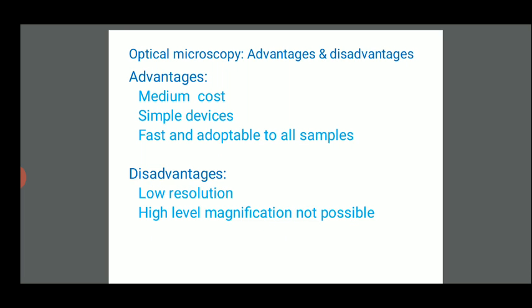And the advantages of optical microscopy are medium cost, simple devices, because these optical microscopes are simple devices having a medium cost, and these are fast and adaptable to all the samples. And there are certain disadvantages also. These optical microscopes have low resolution, and high level magnification is not possible with these optical microscopes.